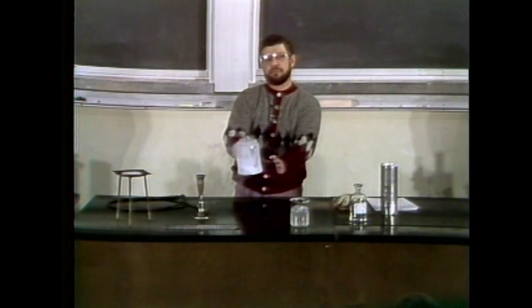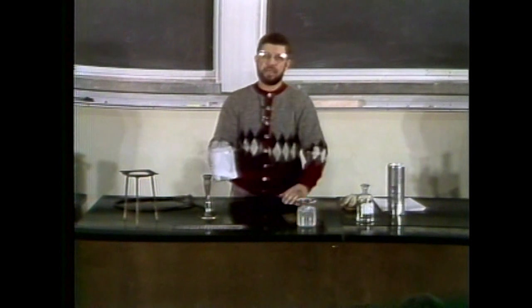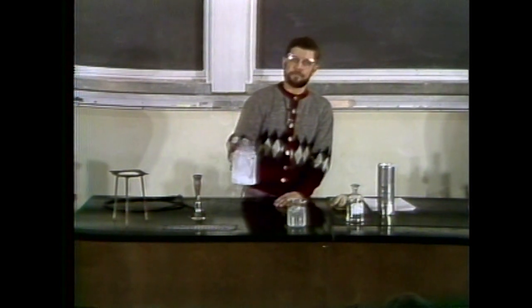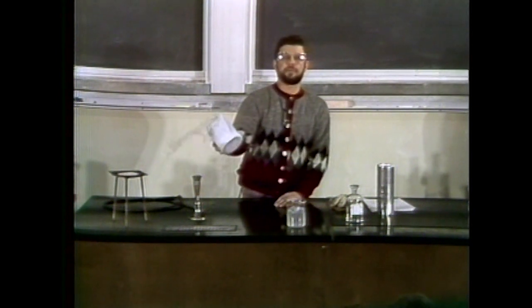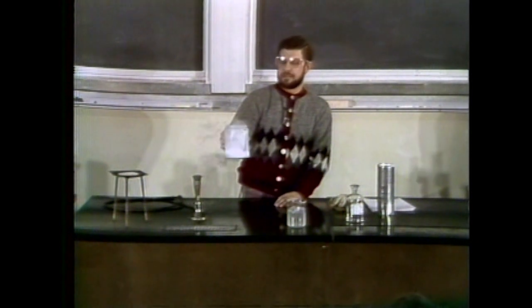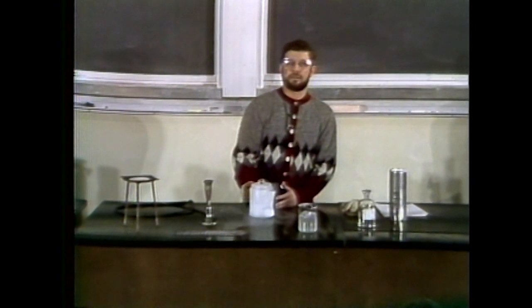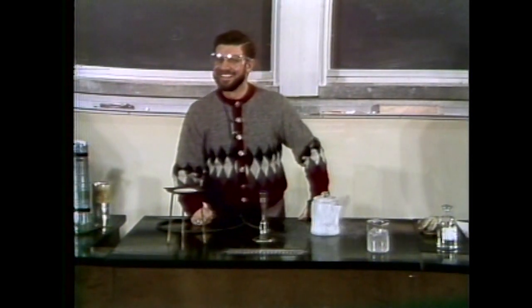We had some cold liquid nitrogen inside the coffee pot, and we supplied it with heat from this burner that has, of course, natural gas as a fuel. So what is this white stuff that's formed at the bottom here? Either CO2 or H2O. Somebody said it's either CO2 or H2O. Where'd the CO2 come from? Methane burning. You sound like a TA. Are you a TA? It's a student.